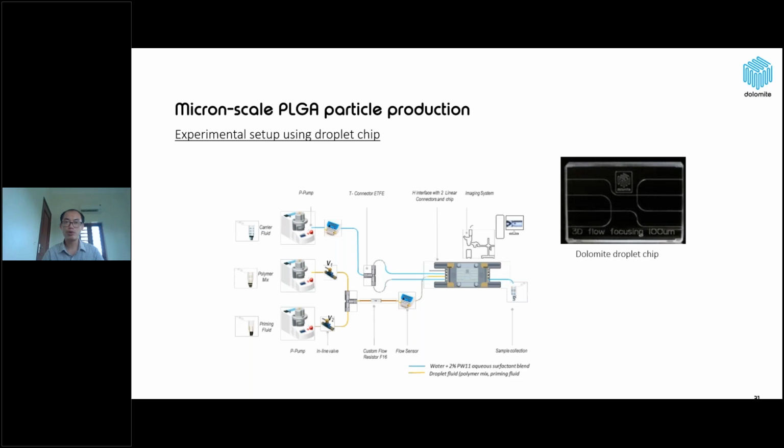So next example, we will learn about microscale PLGA particle production using microfluidic technology. The graph shows the system setup for PLGA microparticle production.